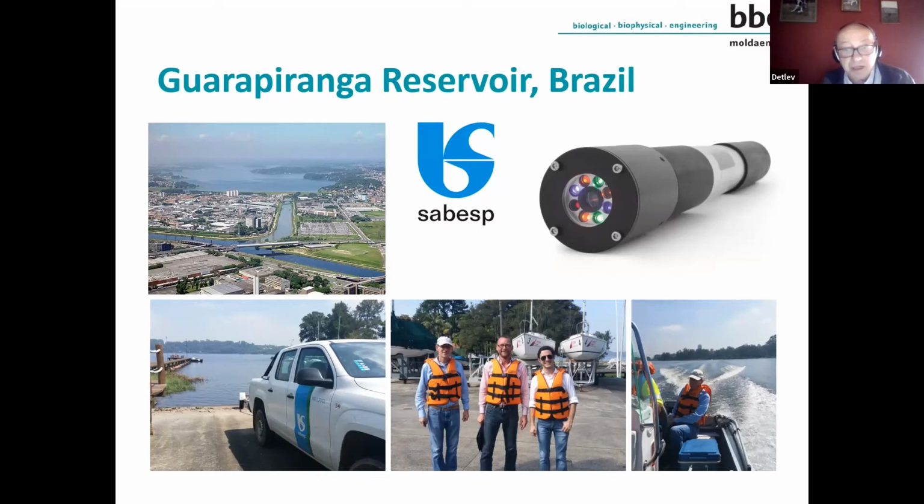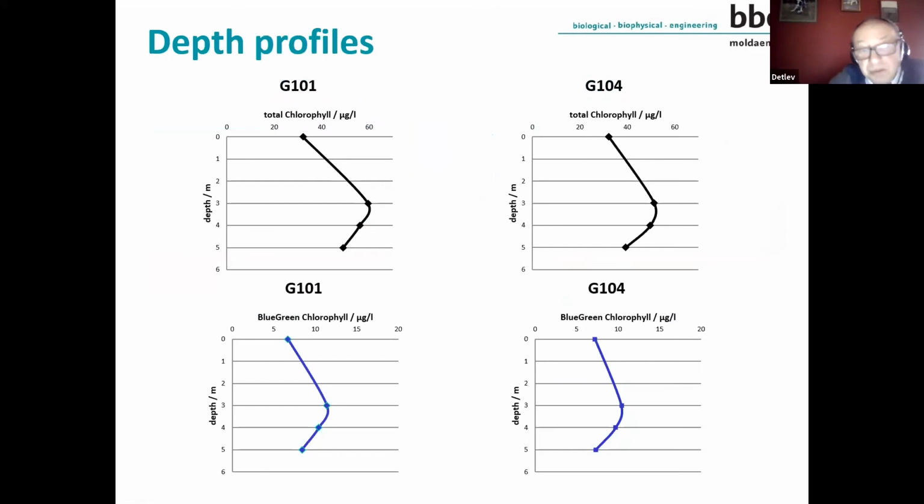And we had the chance to accompany them for a tour where we went out with a boat and tried to measure. Importantly, we wanted to know about the algae content. And here we had a special way of application. We used this AlgaeTorch, which is primarily designed for the measurement of surface water, but here we used it to determine also depths. In the depths, we did a small profiling, and what we could see was that there was some content of blue-green algae.